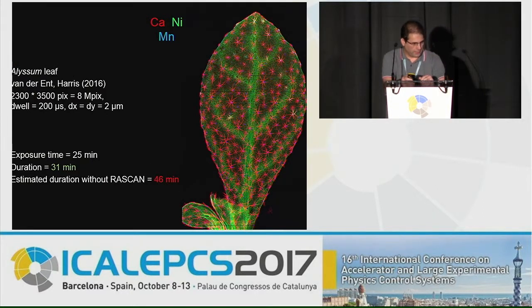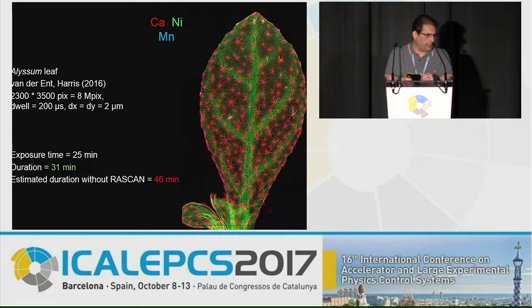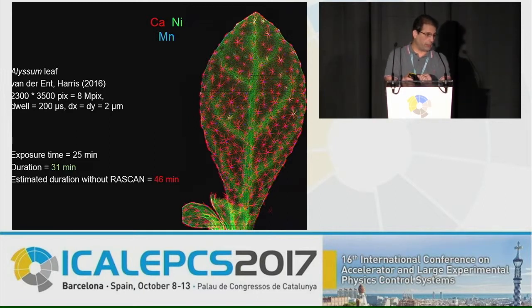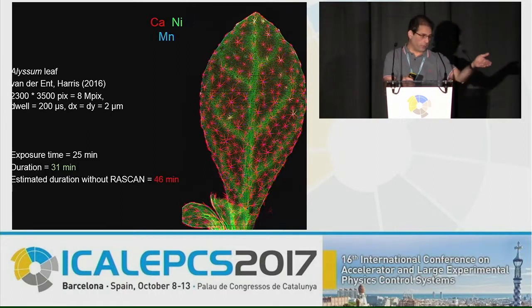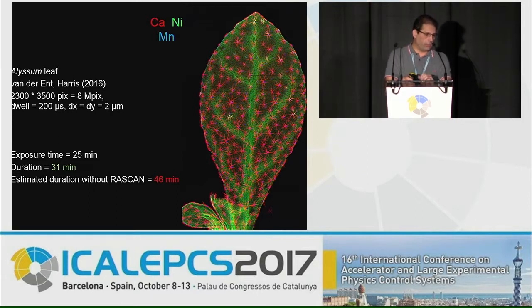This is a nice output image of fluorescence microscopy. The dwell time is 200 microseconds — well below one millisecond — with a pixel pitch of two microns. The full scan was done in 31 minutes for a 25-minute useful exposure time. Without RASCAN, it would have taken 46 minutes.